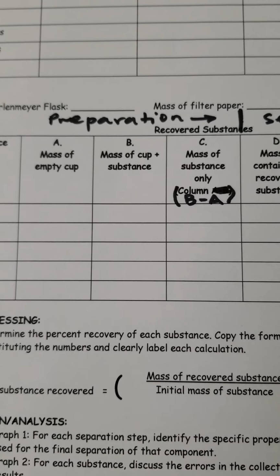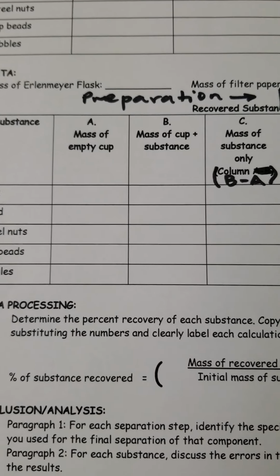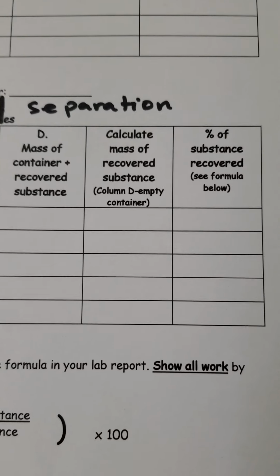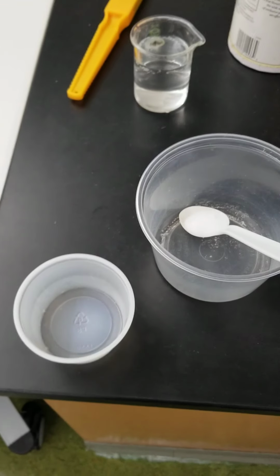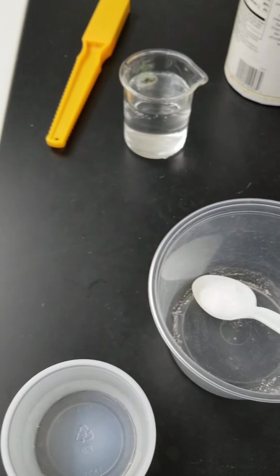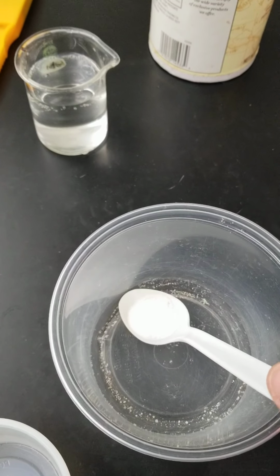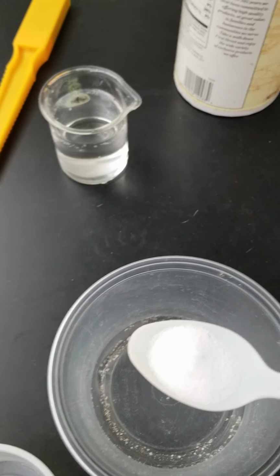And you'll notice up here it says all of those are preparation. That will be the first part of this video. And then the second part of the video, you'll get the result for the separation. So let me step back and start showing you all of the materials. And at this point, this is where I'd like you to start recording your idea of the particle size. I'll also test out a bit of the density for it.